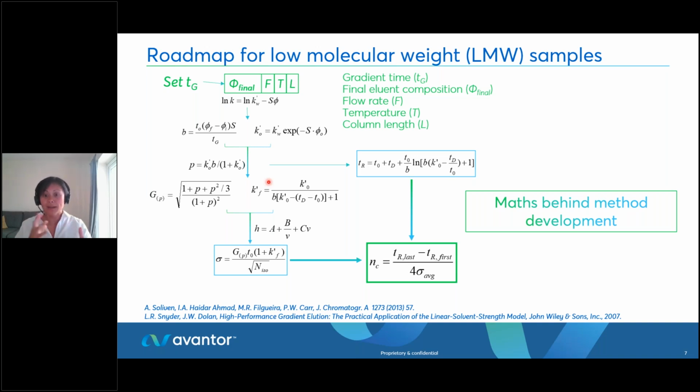So that's why there is a difference, because we're going into the zones where isocratic and Van Deemter theory merge and agree with the maths, the complex mathematical equations when we jump into gradient elution reverse phase theory.